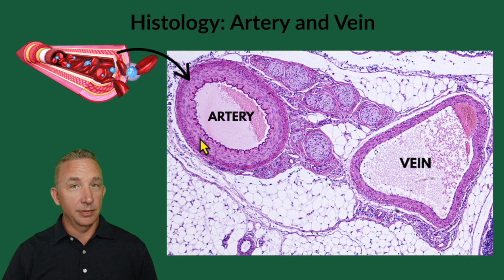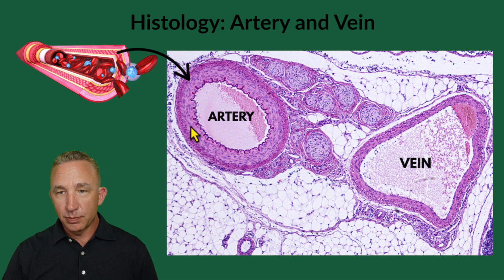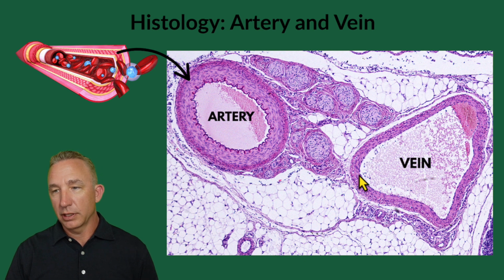So I have that dark ribbon, and then from there is my muscle portion of it. Three types of muscle in the body: skeletal, cardiac, and smooth. This is not my skeleton, it's not my heart, so this is smooth muscle. I don't have control of how I'm going to pump the blood through my body. So this portion here is tunica media in the middle. Tunica media, and tunica media is that muscle layer, specifically smooth muscle. So I just go deep to that.